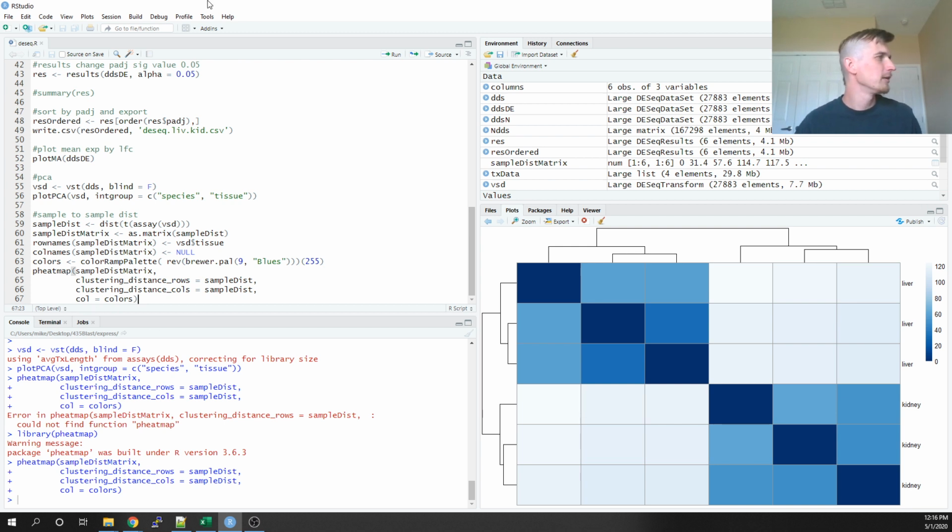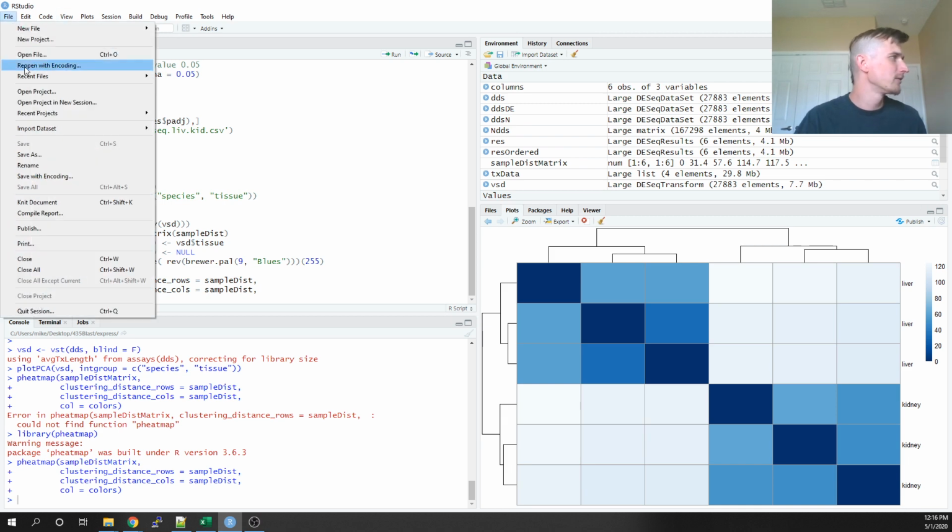I was thinking last night that this is kind of the equivalent of watching Bob Ross paint, but with computer stats and programming languages, right? You won't be able to produce a Bob Ross painting, but you can at least be guided through and see what's being done, if only to know that all this stuff exists. Anyways, let's start a new script.